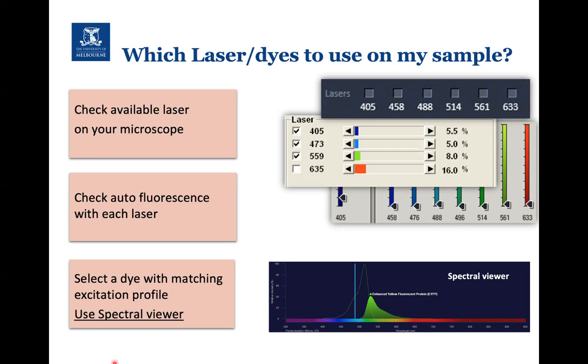So here at BOMP, each of our microscopes has a specification sheet which you can check. That's all available on our webpage, if you want to go and have a look and just double check that the system that you want to use has the correct laser.